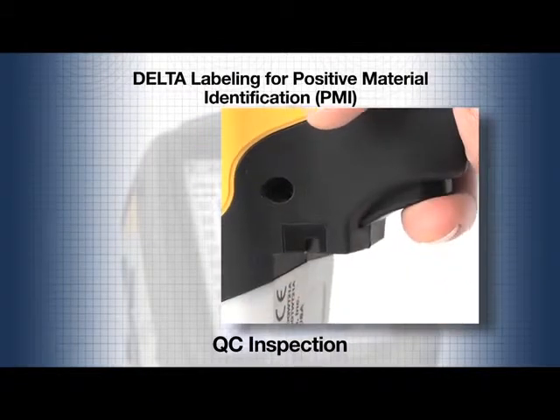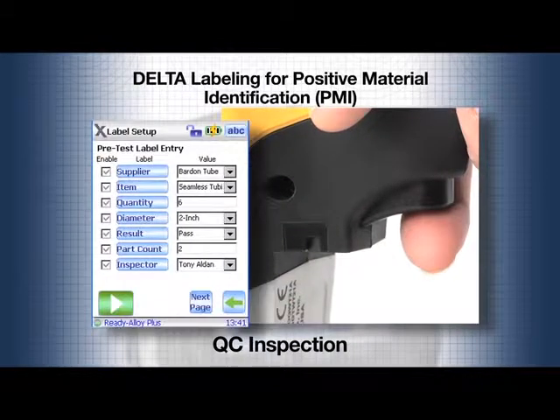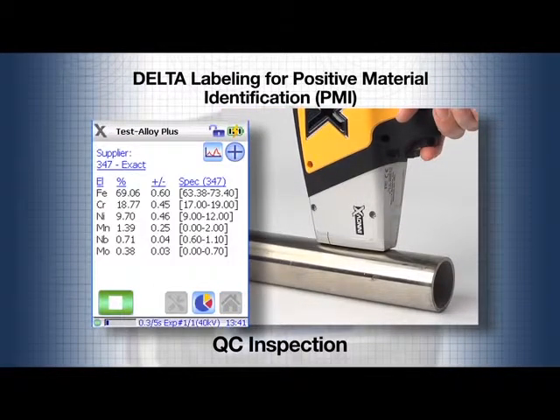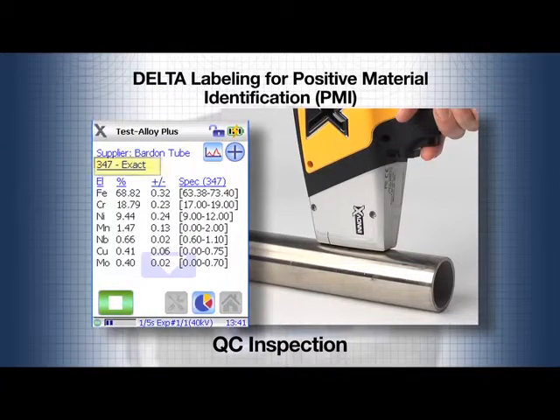When the trigger is pulled to start the next test, the label window comes up. The part count increments to show that the second part is about to be tested. Pull the trigger and the test commences. The second tube is also the expected 347 grade.